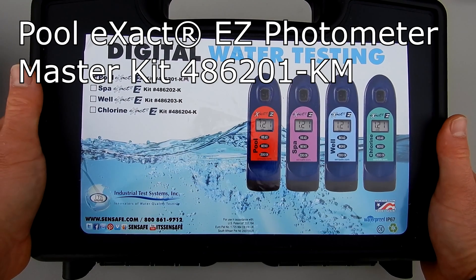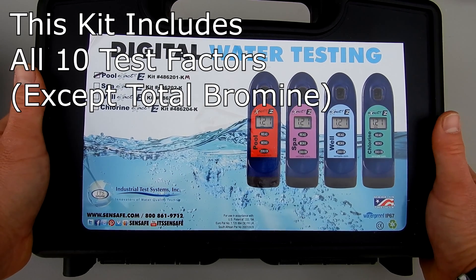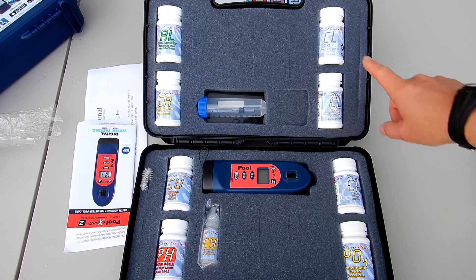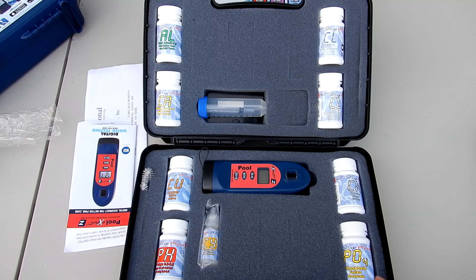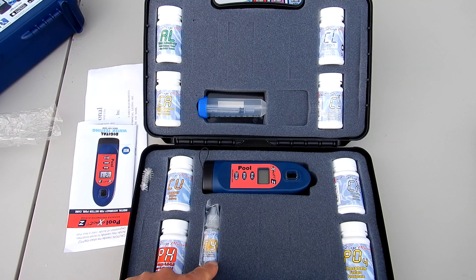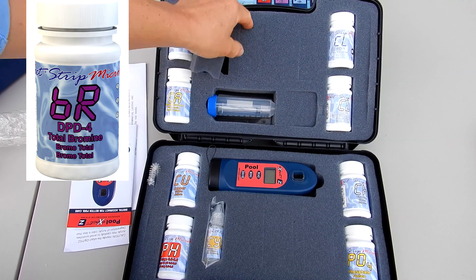This is the pool exact easy photometer master kit, 486201-KM. This kit comes with more of the exact strip micros and also slots to add more. You have free chlorine, combined chlorine, chloride or salt, phosphate, pH, copper, calcium hardness, total alkalinity, and cyanuric acid. Also included is a test tube and a syringe, and this kit comes with more available slots if you wanted to add more test strips.